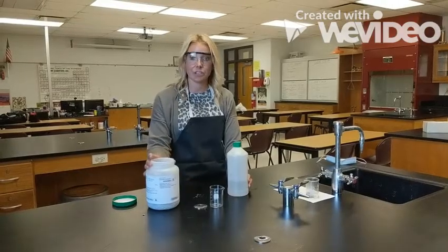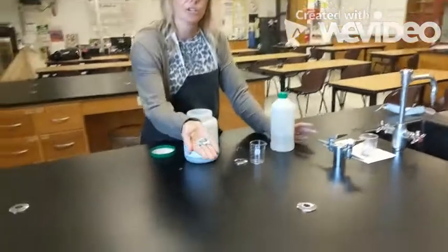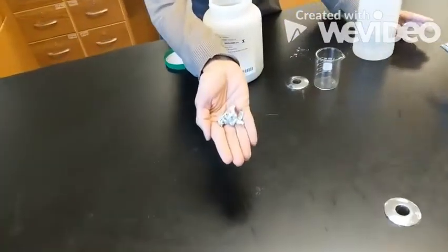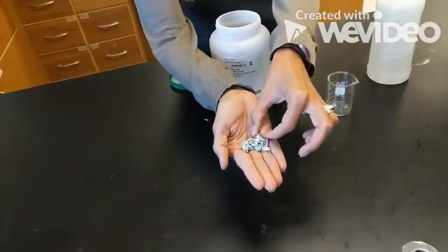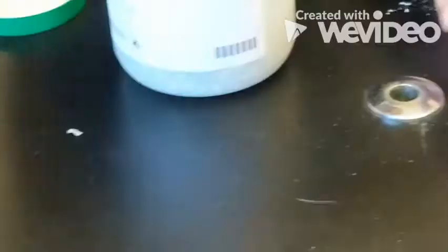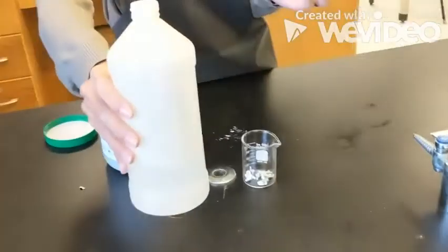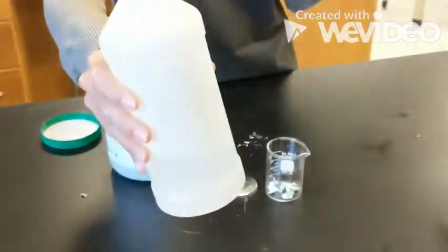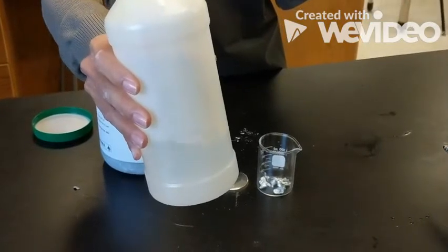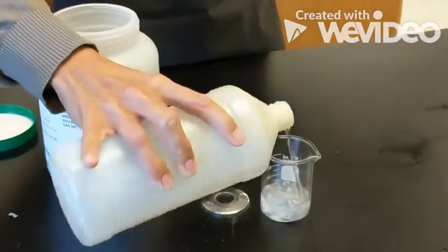And this is Station 3, so you're going to notice I have some zinc metal. So take a look at what that looks like beforehand. Make some observations. I'm going to put our zinc into our beaker, and I'm going to take our hydrochloric acid, so you can see your observations beforehand of your hydrochloric acid. And I'm going to mix the two of them.